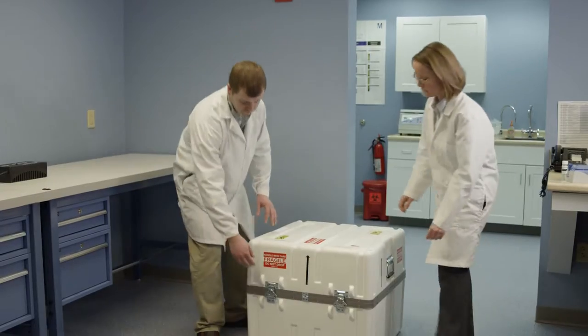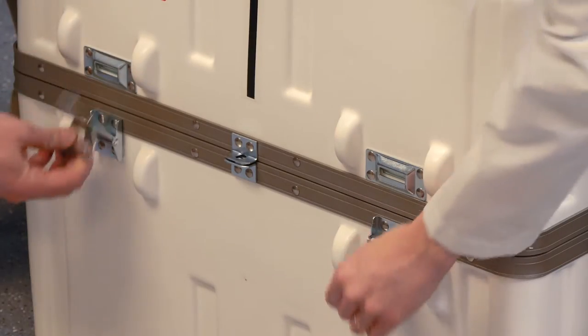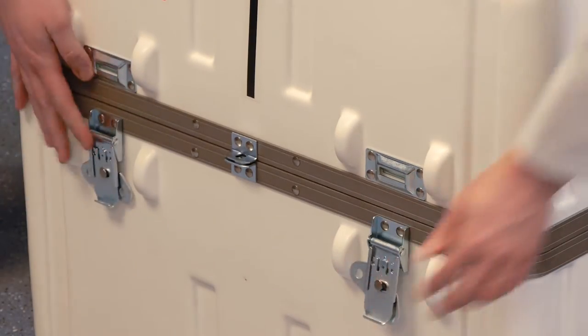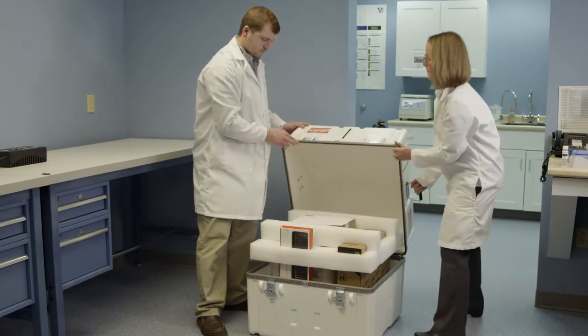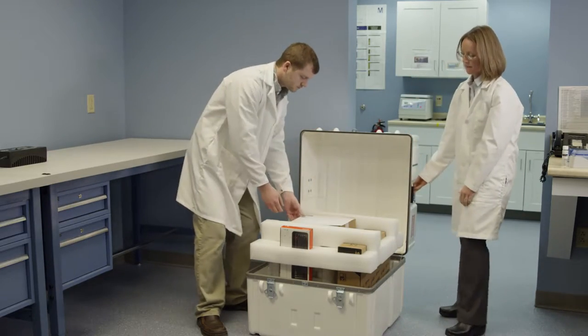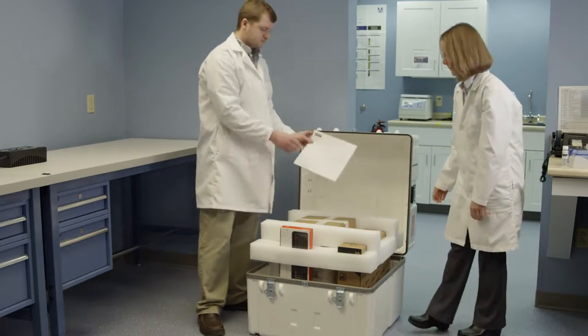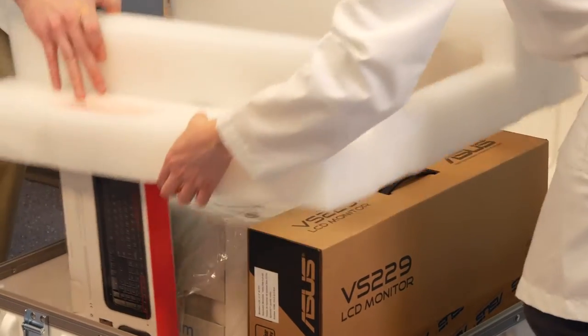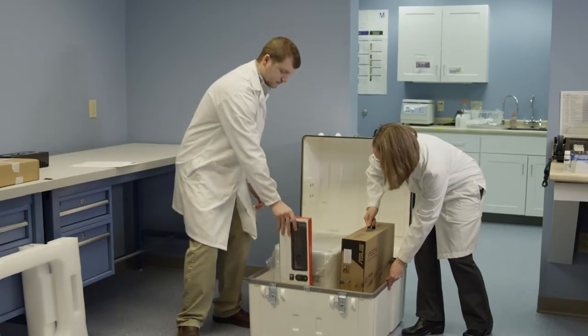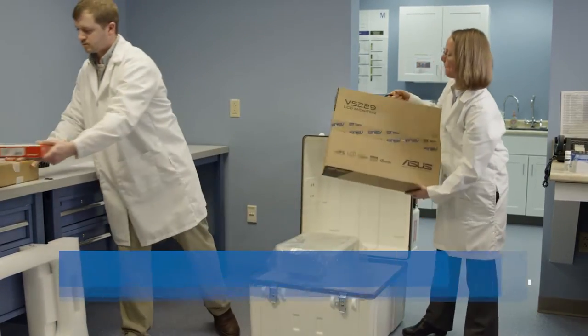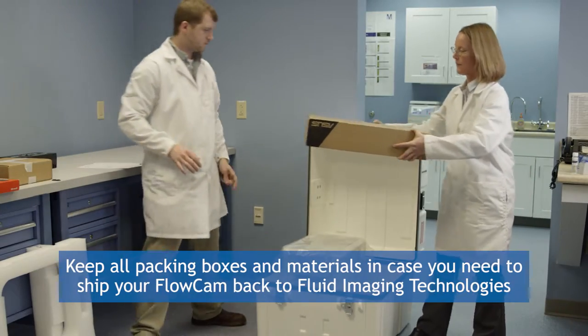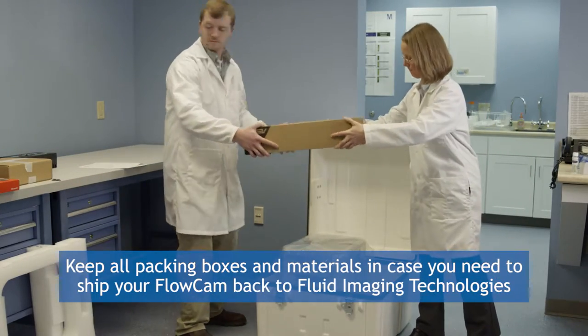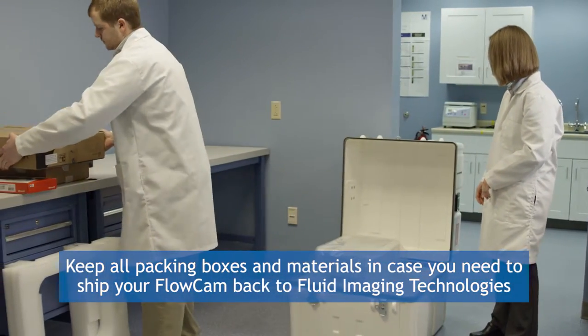Once you have your lab space prepared, begin by opening the packing crate for the FlowCam 8100. Ensure that there is no damage to the packing materials or equipment inside. Start by removing the filling material and 8100 accessory boxes. Be sure to keep all the packing boxes and materials in case you need to ship your FlowCam back to Fluid Imaging Technologies.